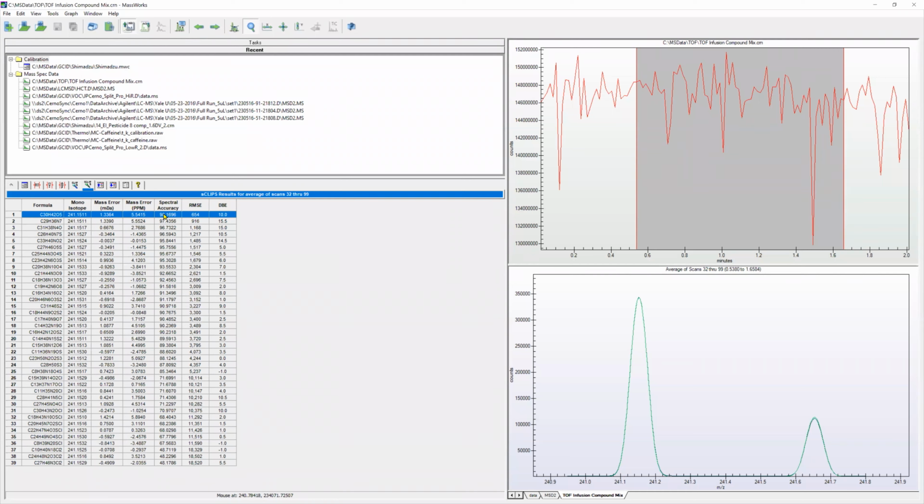You'll probably get 3 that are pretty close matches in terms of spectral accuracy, but that's a huge bonus in terms of helping do unknown formula ID. So that's it. I'm going to turn off my display here, and then we'll take any questions that you might have.